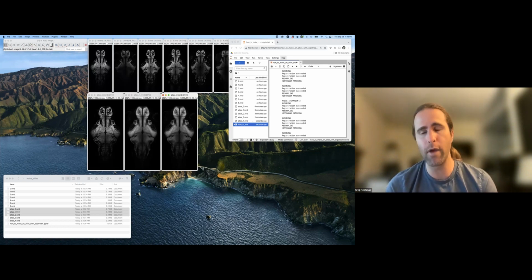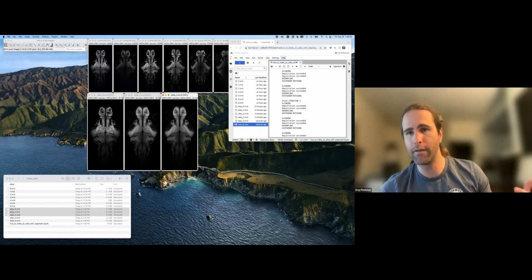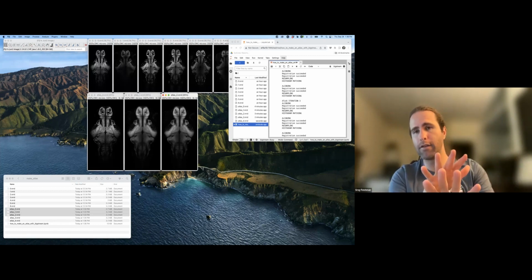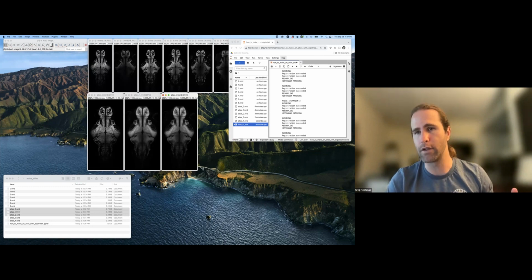It's possible that if you had channels that had sufficient overlap in the areas where signal was expressed, you could use different channels. What would happen is that only the areas that are common, the intersection of expression, would end up being present in the atlas in the long run because of the averaging. So you have multiple subjects aligned to each other, and then you're averaging all that together. Only one subject has this structure labeled, so that label doesn't show up with enough signal in the average, and so on.